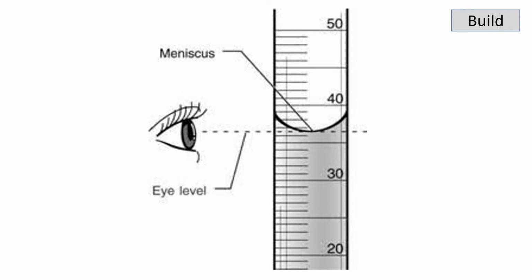Here's a point about being accurate and getting precise results. Accuracy is more about what you're doing, precision is about your equipment. So for your equipment here, you would use a measuring cylinder that has enough intervals to make the intervals smaller, so you get more precise results. To be accurate, you're getting down to eye level, and you're measuring the meniscus line. Liquids will naturally curve in a container. You don't often see it because obviously the containers are usually wider. But in measuring something, you can see that curve. And you will always measure at the bottom of the curve. That's called the meniscus line.